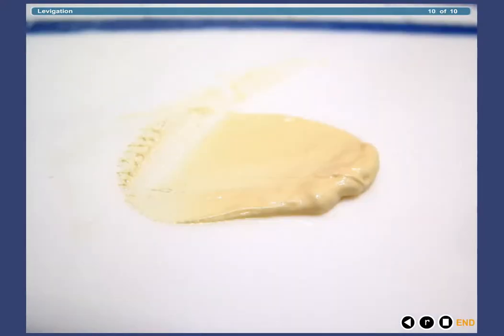The final levigated product should have a pasty or thick lotion type appearance. In this levigated state, the solid is now ready to be incorporated into many pharmaceutical bases.